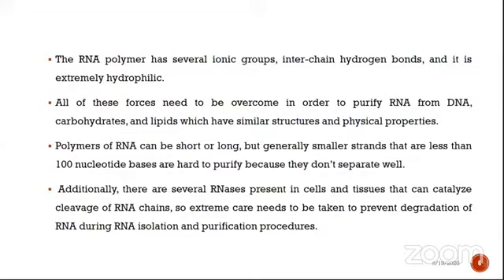RNA polymers are of different lengths. They may be short or long, but short stretches of RNA of less than 100 nucleotide base pairs are basically hard to purify, and it is difficult to separate the smaller stretches of RNA. In addition, there are several RNases, and these RNases degrade or cleave the RNA chain. So in order to prevent the degradation of RNA during RNA isolation, we need to avoid the presence of RNases.